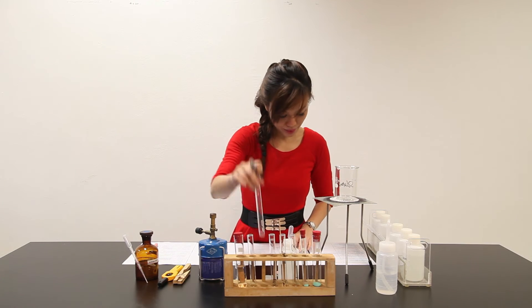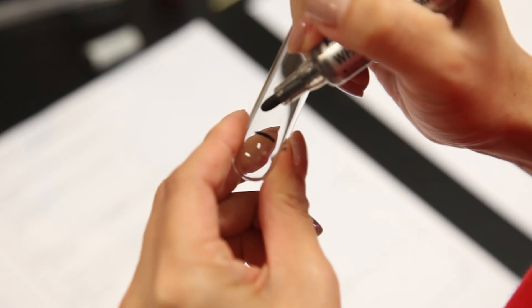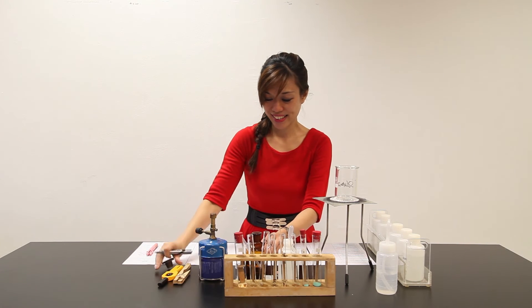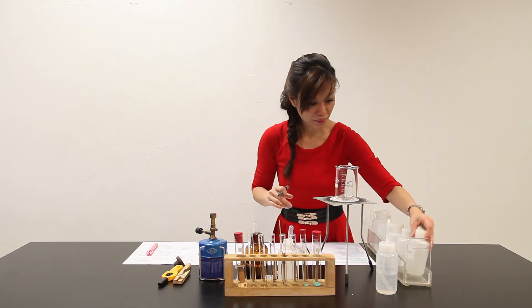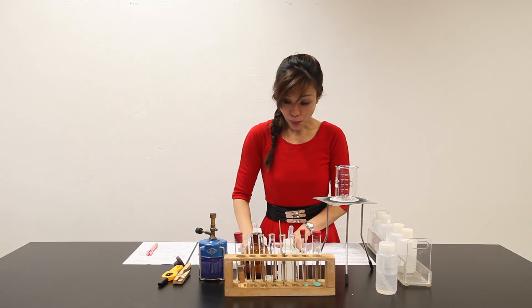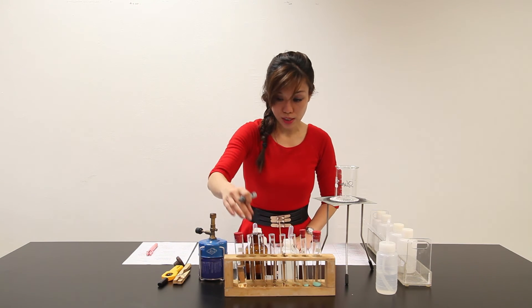Part E: place about 1 cm³ of Solution Z in a clean test tube and add about another 1 cm³ of dilute nitric acid, followed by another 1 cm³ of barium nitrate. And another 1 cm³ of Solution Z in a clean test tube. Place another 1 cm³ of Solution Z.